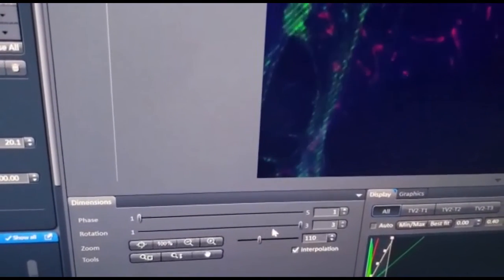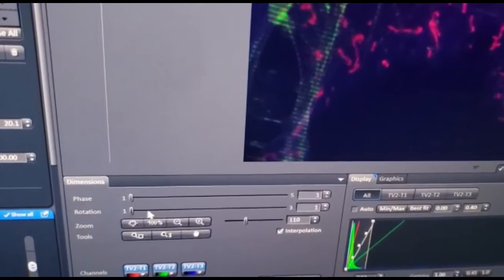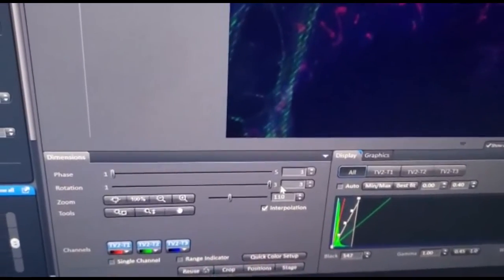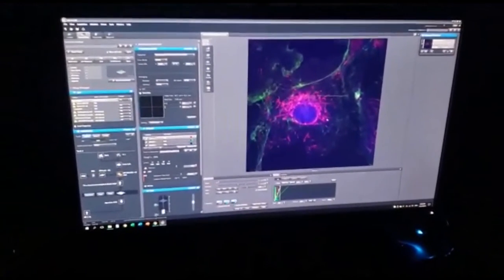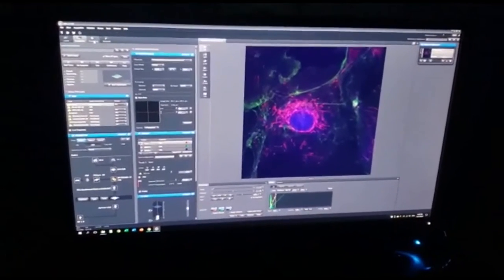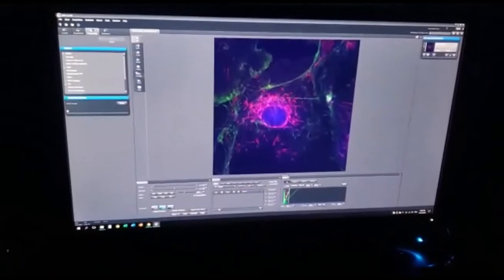As you can see in the top part of the video, the grids are making a composition of the final image that we have. So after best fit of this image, we are able to process this image in the other part of the analysis.